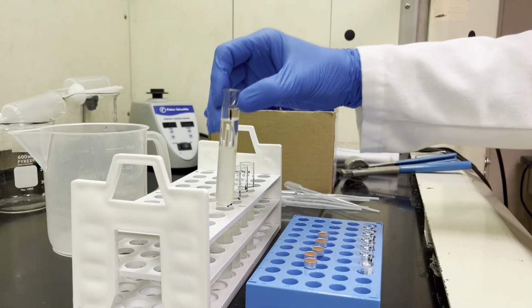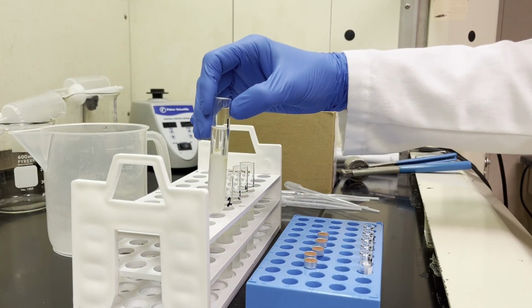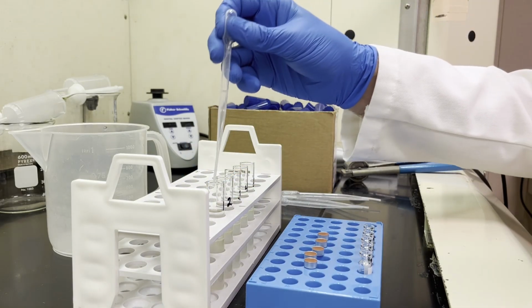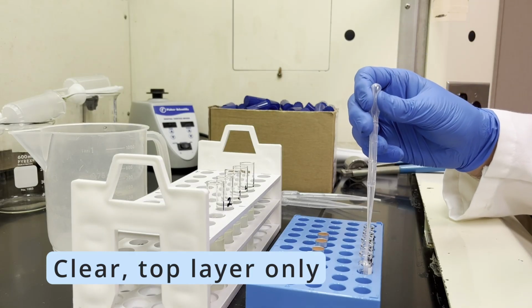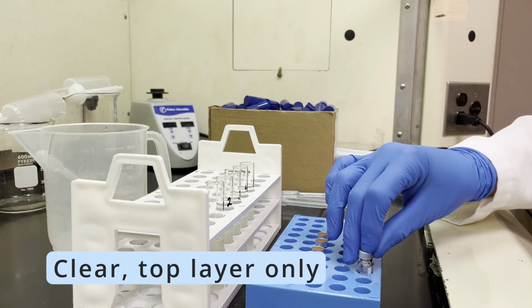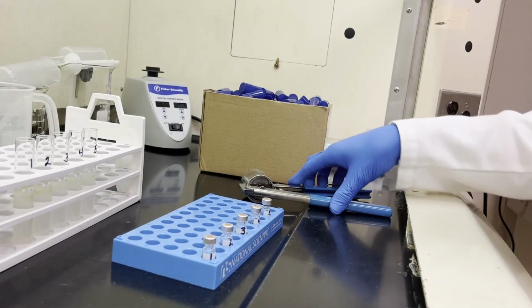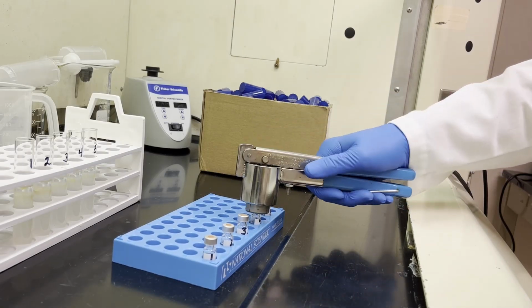After about 45 minutes, the 2 layers have separated and the top heptane layer is completely clear. Sampling only from the top layer, approximately 1 milliliter is taken and aliquoted into the injection vial. The vials are capped and sealed and are now ready for injection onto the gas chromatograph.